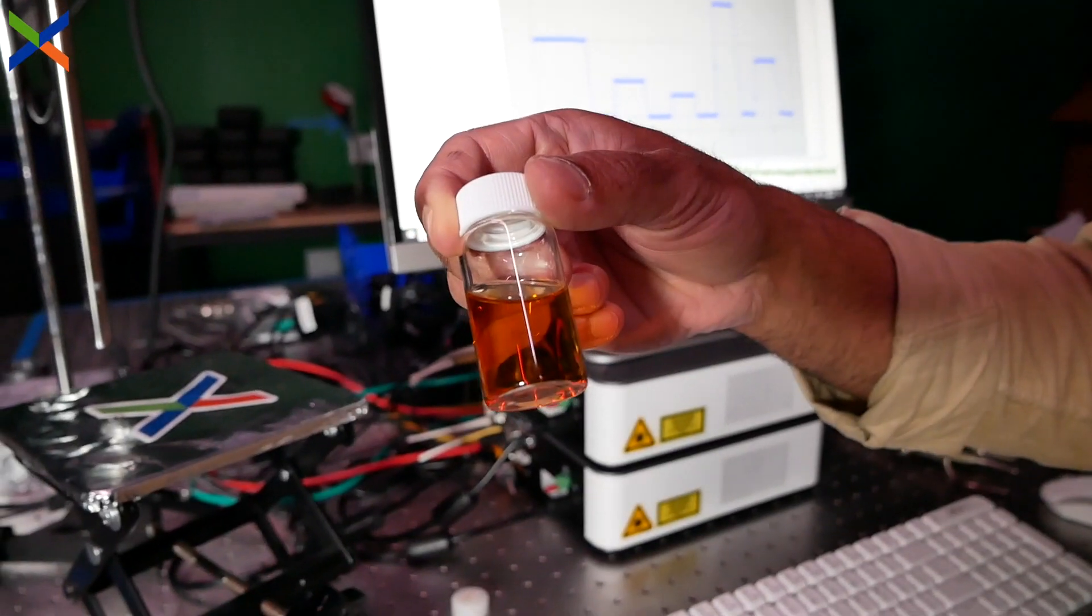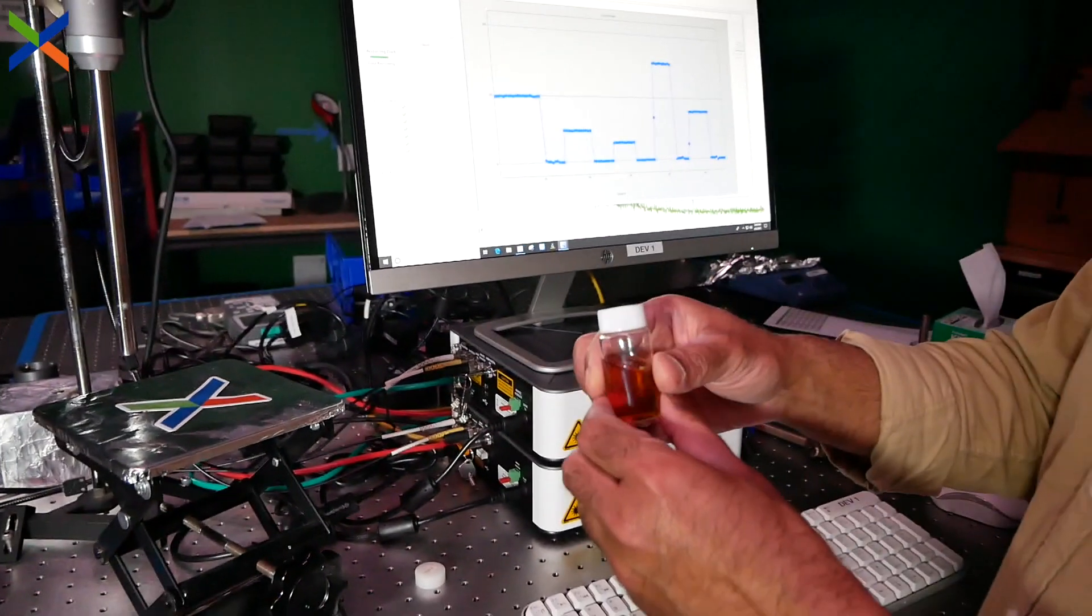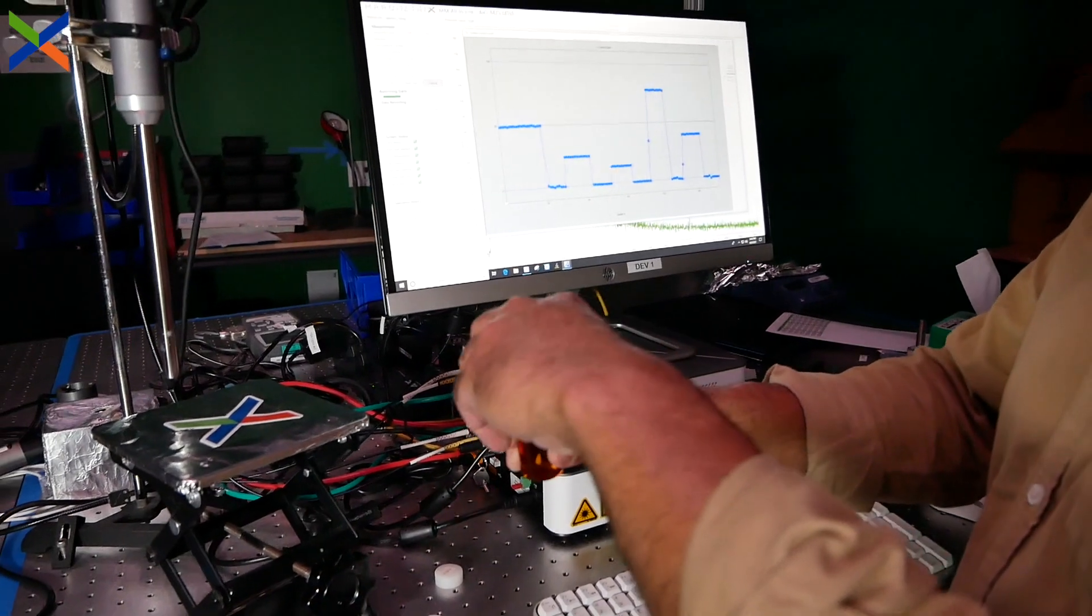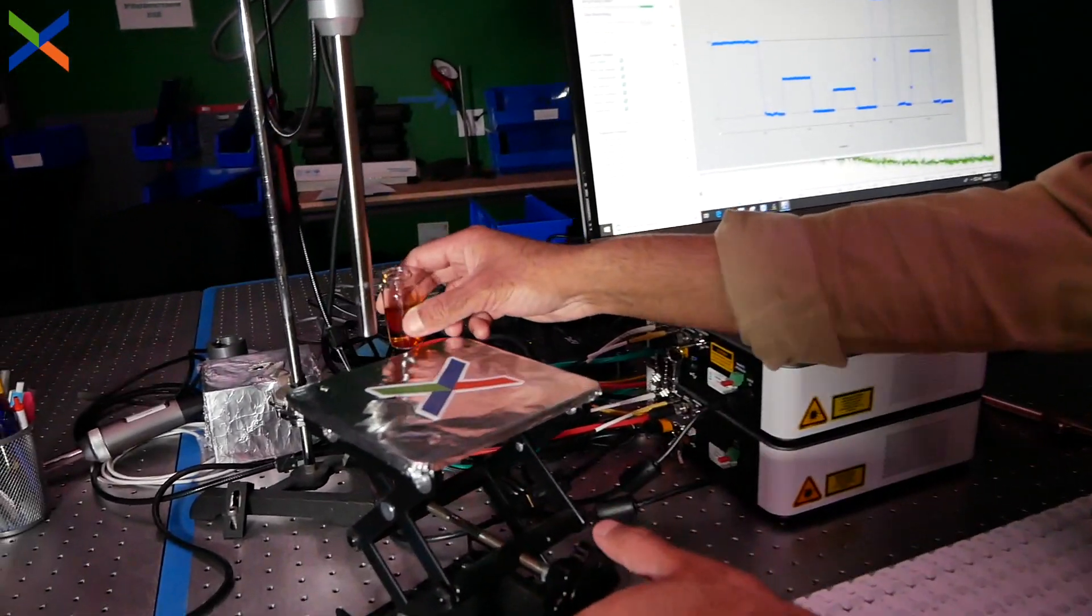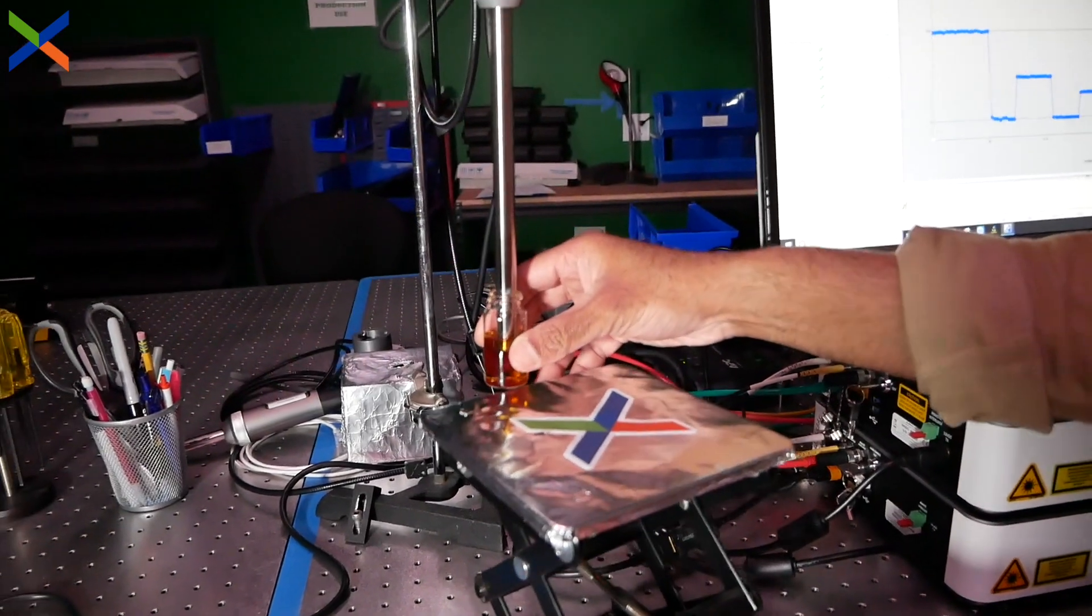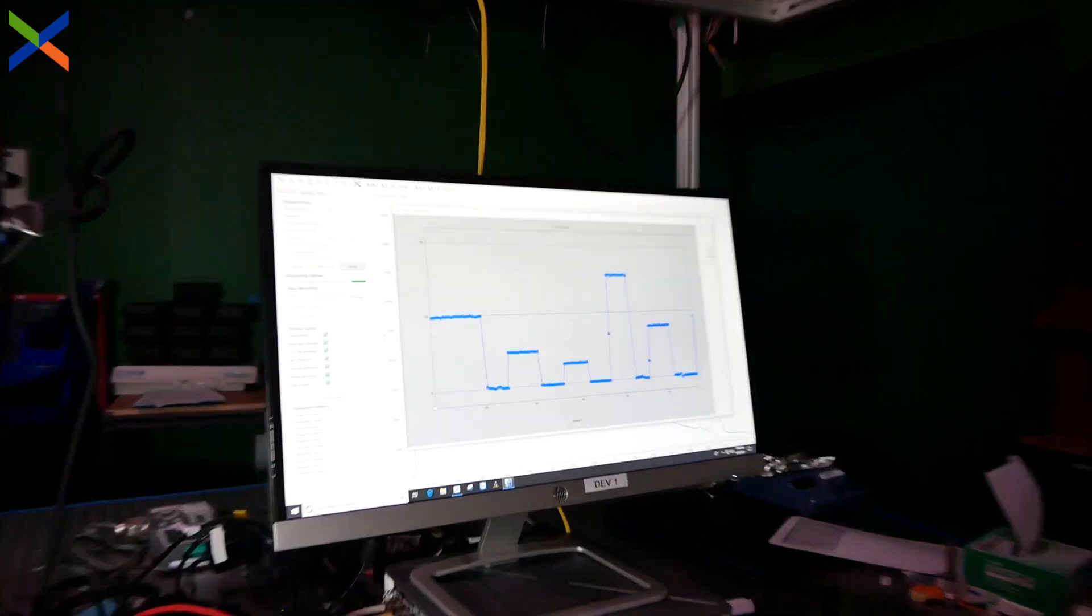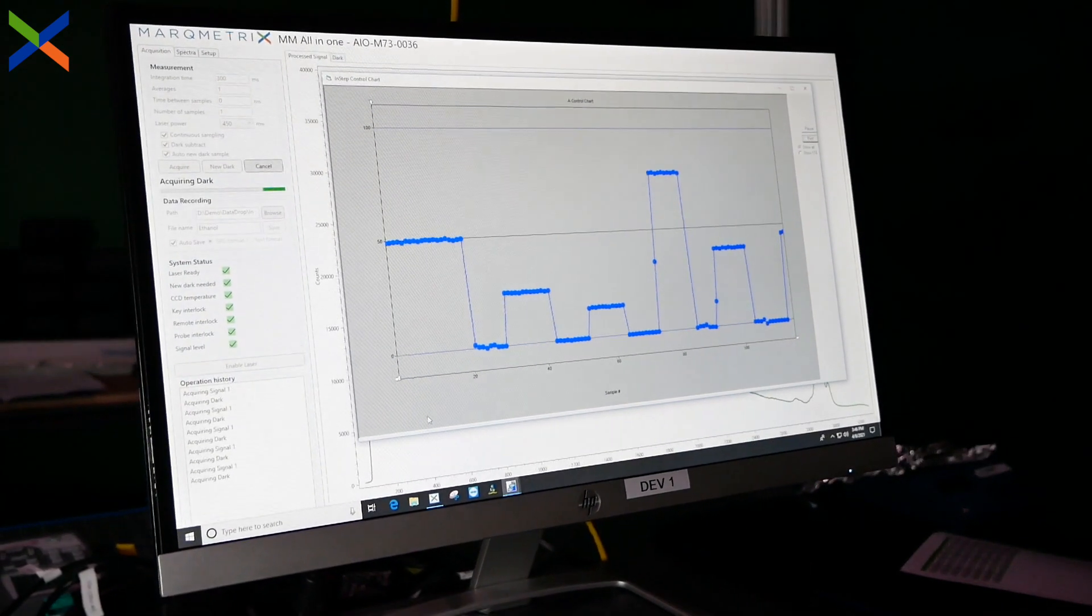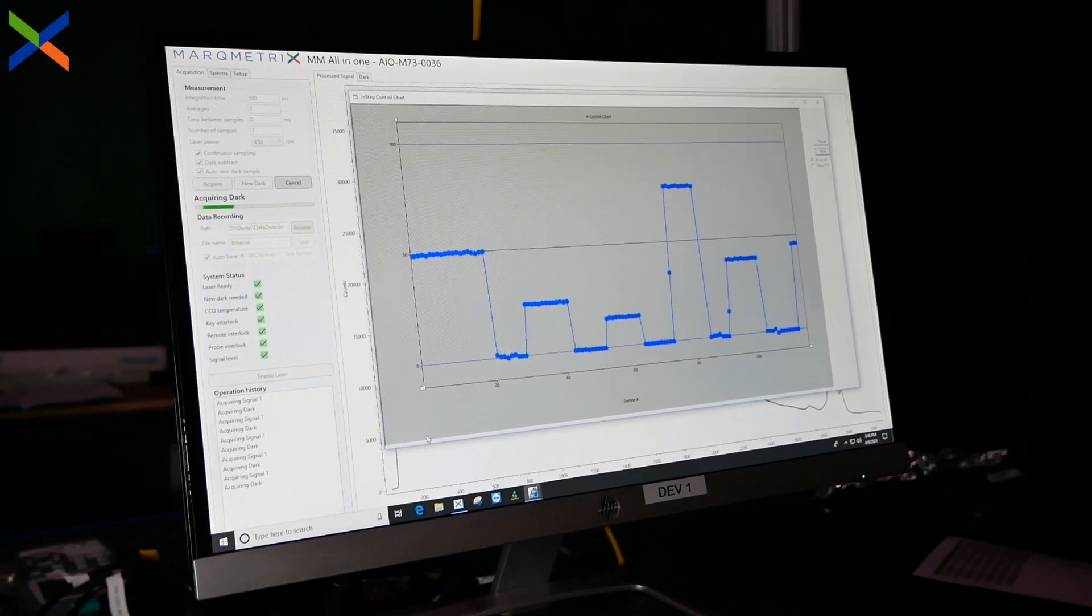Step three is using the model to predict in real time. Now we can test some unknown samples and let the model predict the alcohol percentage of alcohols like whiskey and tequila. We can see that the predicted percent volume of ethanol in whiskey is 45%, and the tequila is 40%, which matches values reported on the label by the manufacturers.